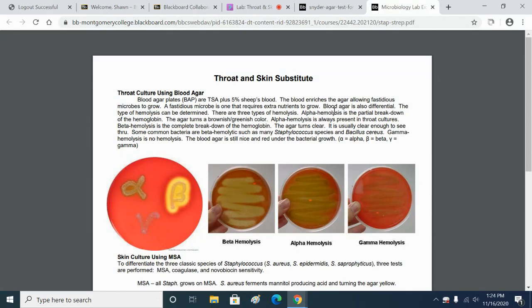If you remember from the growth patterns experiment, the green extracellular pigment was produced by Pseudomonas aeruginosa. I had to go look that up when I smelled her plate, because I would not have imagined Pseudomonas would be in anyone's throat. And it is rare. Only about 5% of people have Pseudomonas aeruginosa. So you never know what you're going to find in a throat culture.